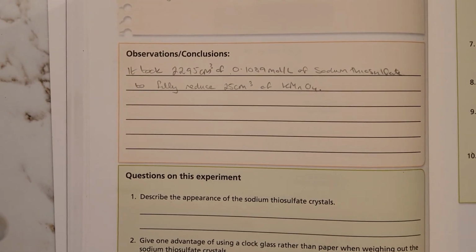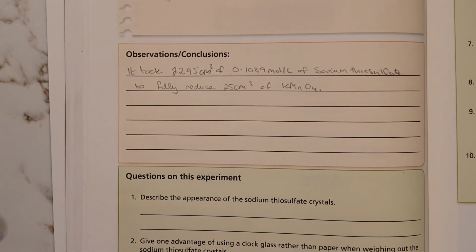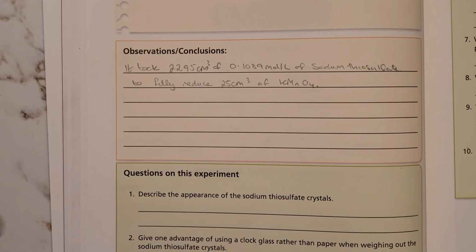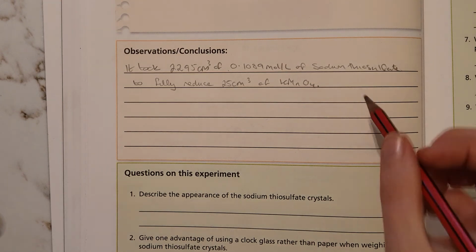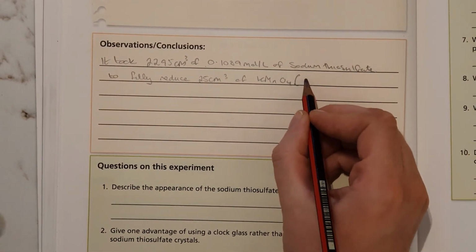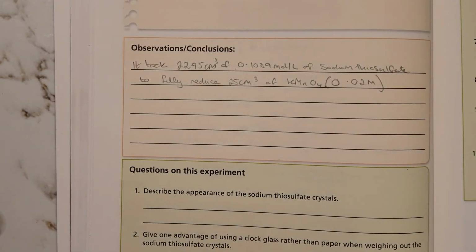And your conclusion is just taking that calculation and writing it into an English format. So I said it took 22.95 centimeters cubed of 0.1089 moles per litre sodium thiosulfate to fully reduce 25 centimeters cubed of KMnO4, and you can write in your molarity there. Okay, and that's it apart from the questions.